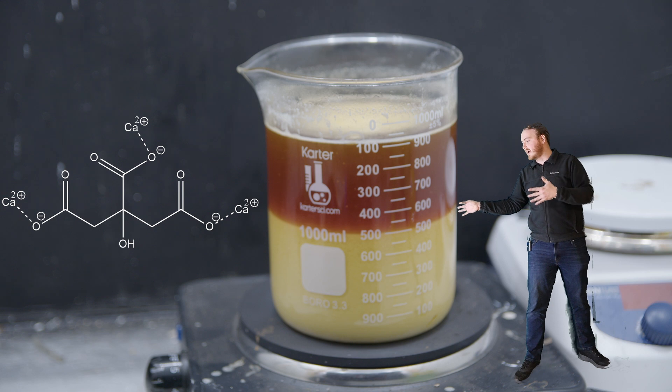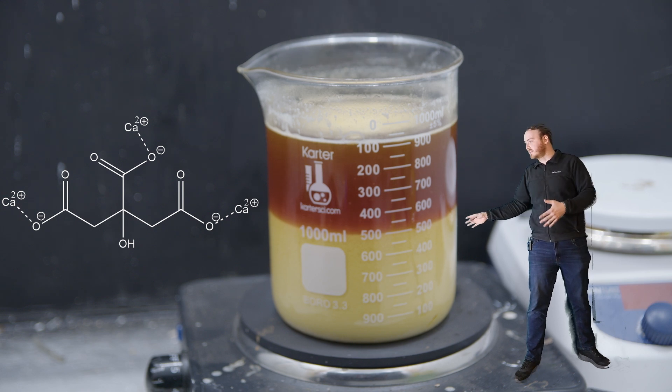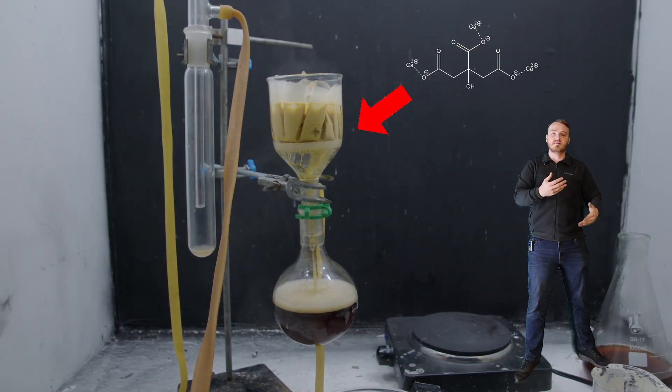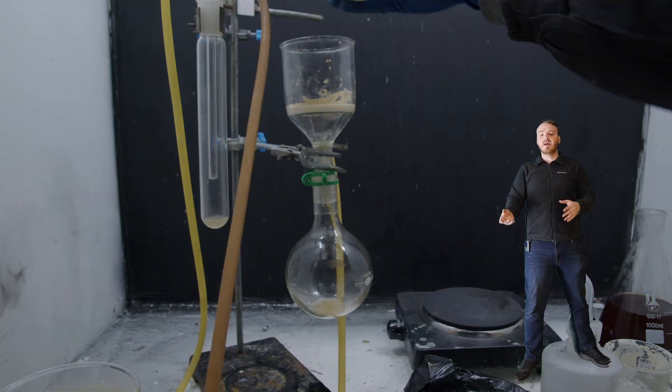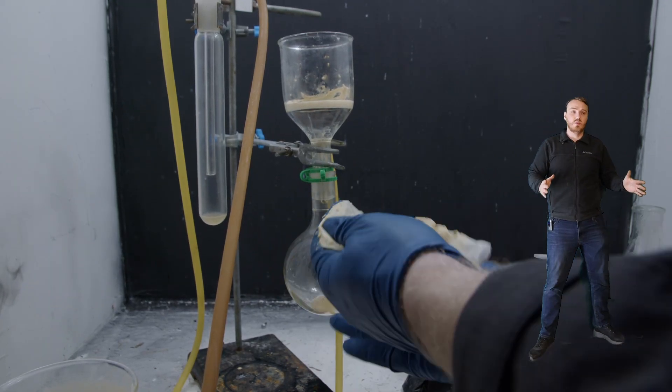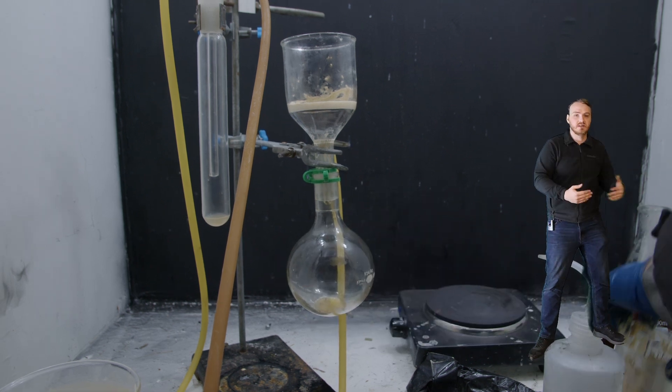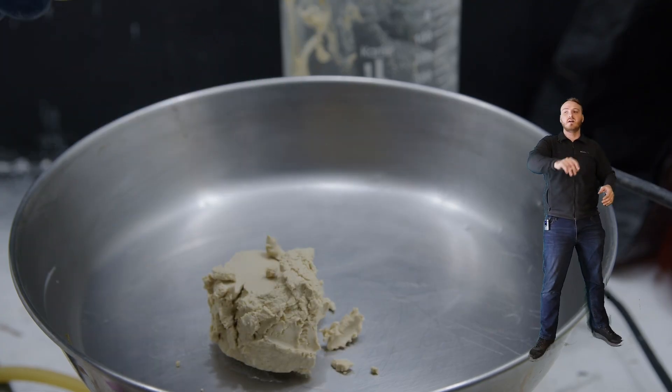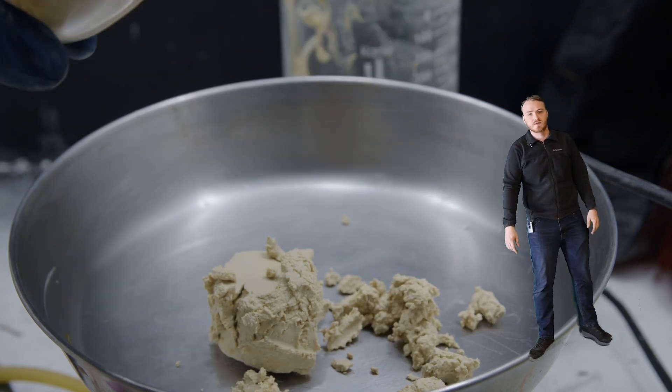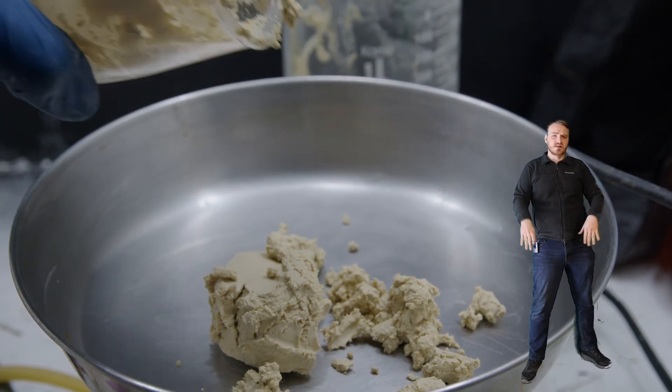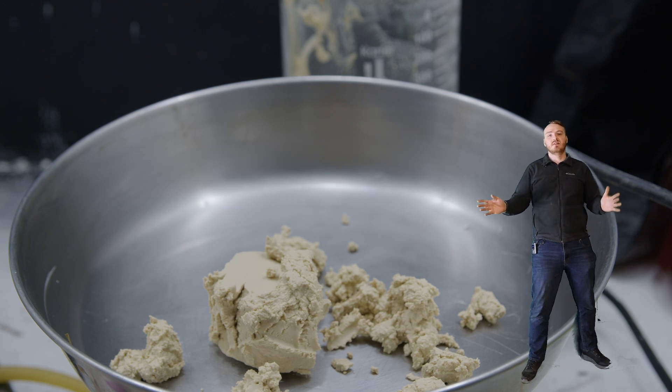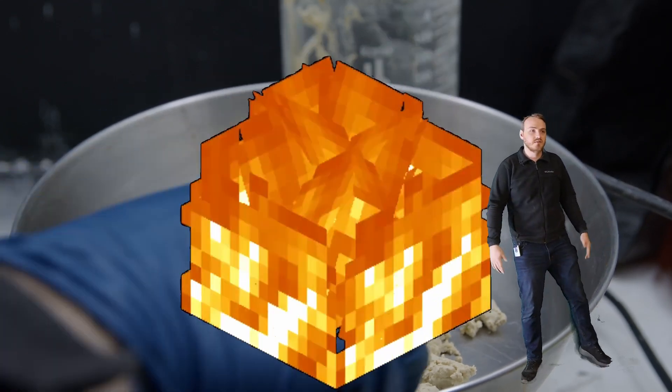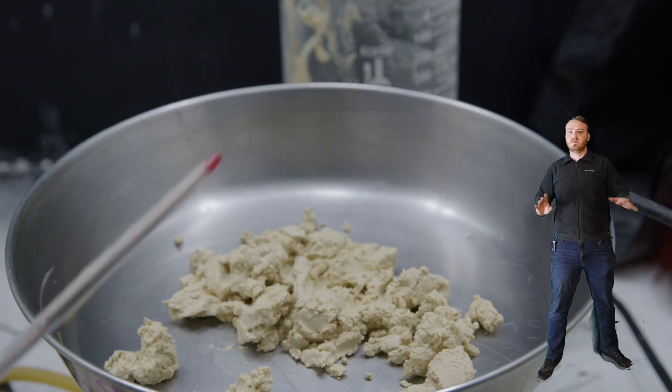So you end up with this solid tricalcium citrate in this disgusting solution here. Then we run it through a filter and that just gives us the solid tricalcium citrate. When we get it out, it's a little bit wet. Now we can't have it wet because we need to weigh it to do some calculations. So what I do is I set my hot plate to 80 degrees, plop it on there and let the water come off over a few hours. There's lots of different ways to dry out stuff. This is by all means not the best way. You don't want to get too hot. This could be a little dangerous because then it'll burn the citrate and you ruined your product, but the temperature is controlled here so it's not a big deal.